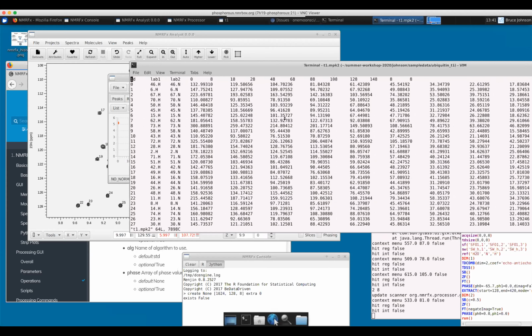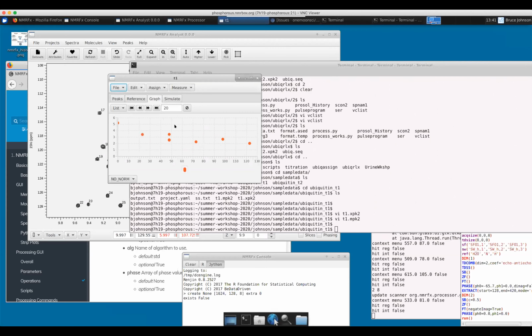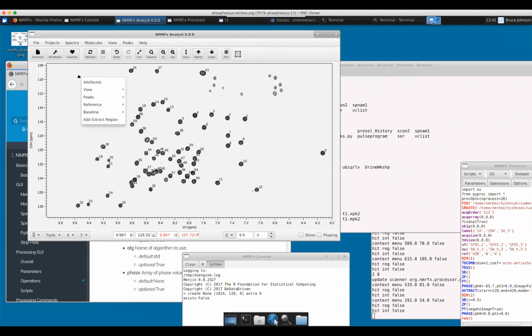You could go in, if you need to convert counts, and change this header to correspond to the correct numbers, however you want. But you did a fit on that right click menu, and if you fit it, will it store the code? The fit I did, the one that I chose, when I did fit planes, it fits the intensity in each individual plane. It fits the line shape and width across the whole column of peaks, and it fits the intensity separately, but this one is not doing an exponential decay. Oh, okay. Fit planes fits the actual intensity at that peak.